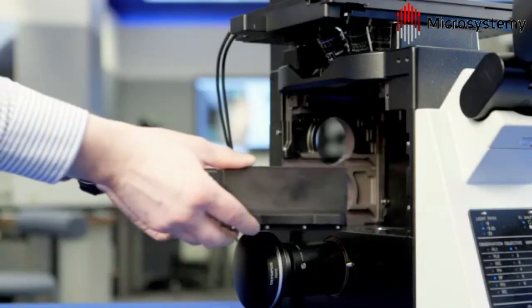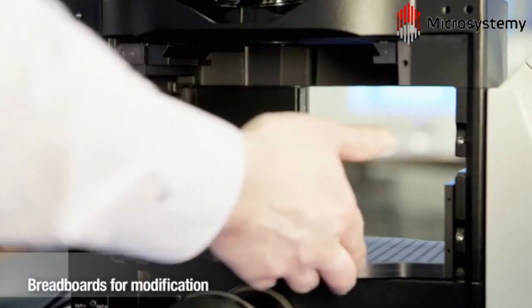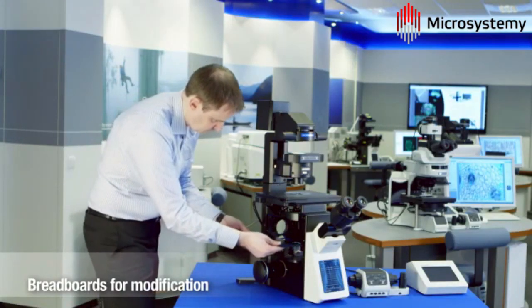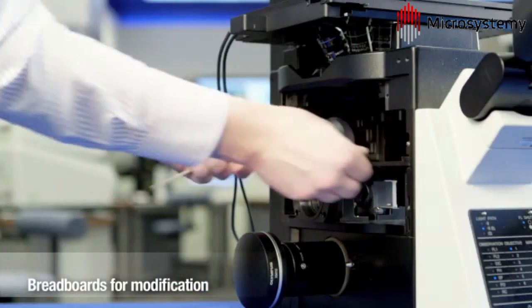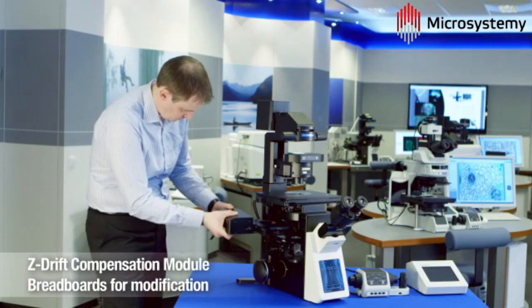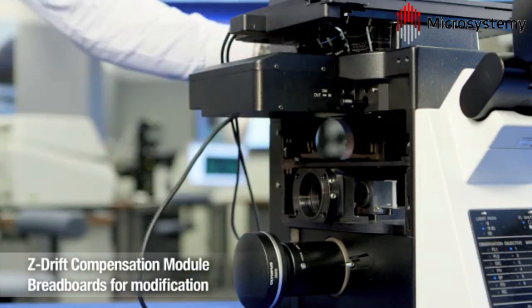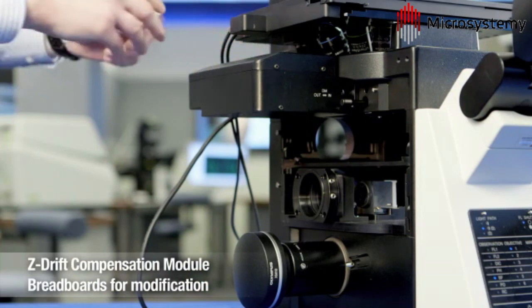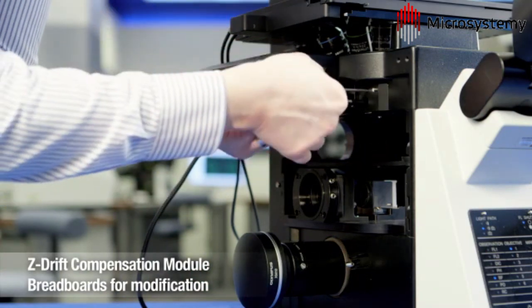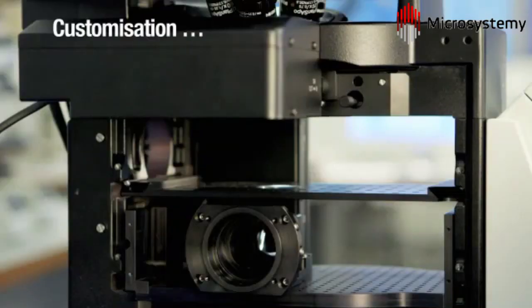The Olympus breadboard support for third-party modules allows users to set up their own customised systems, which is where the concept of open-source microscopy really comes into its own. Although the IX3 frames are used with custom modules, users can still access the benefits of the Z-Drift compensation module. Who knows where this handing over of system design to the microscopy community will lead? It will certainly push the boundaries of new technologies.